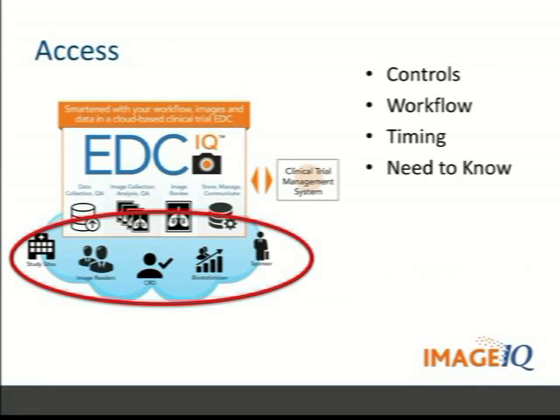Right, so the next part of this story is access control. Now you've got somebody who did the measurements, and in general, you need to control the access to the data. Who's allowed to do what, like you showed, you signed off, and we had already assigned ourselves as a reviewer. The workflow of that and the timing of that access control: at what point in time is someone allowed to see something, and what are they allowed to see? Is that a fair way to say it?